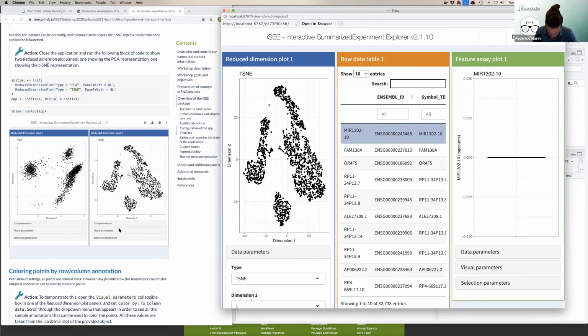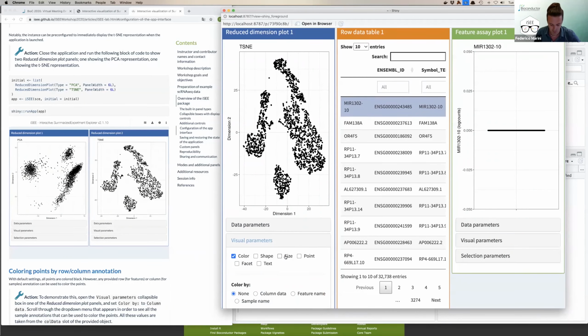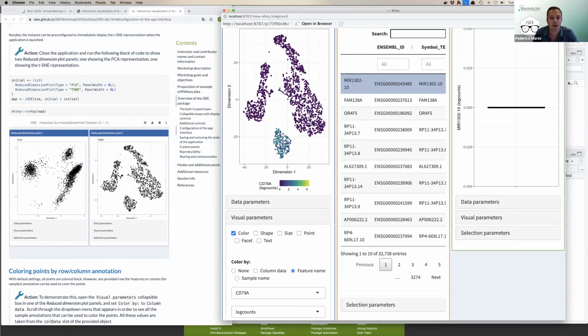Otherwise, I'm just going to touch point-wise on each feature, otherwise it's going to take too long. So we can display, for example, the expression level of any gene of interest. Let's take CD79B in this case, which was a marker for B cells, if I remember correctly, or CD79A, was it? Yes. Sorry for hiding it with the autocompletion. And that's marked in this one.